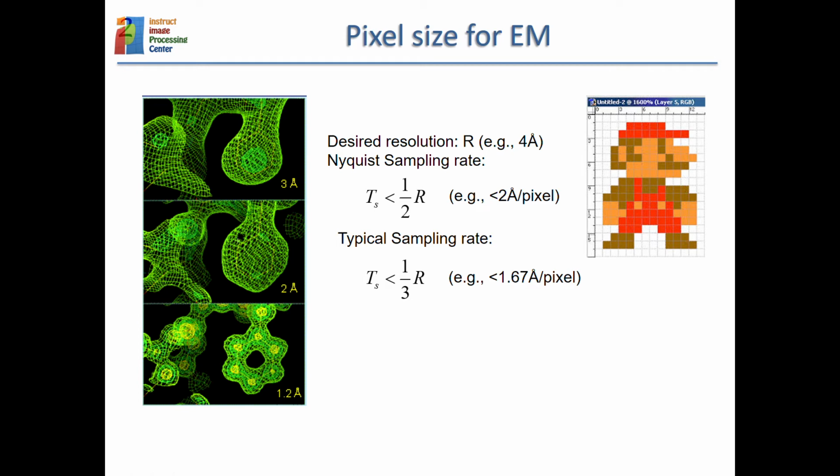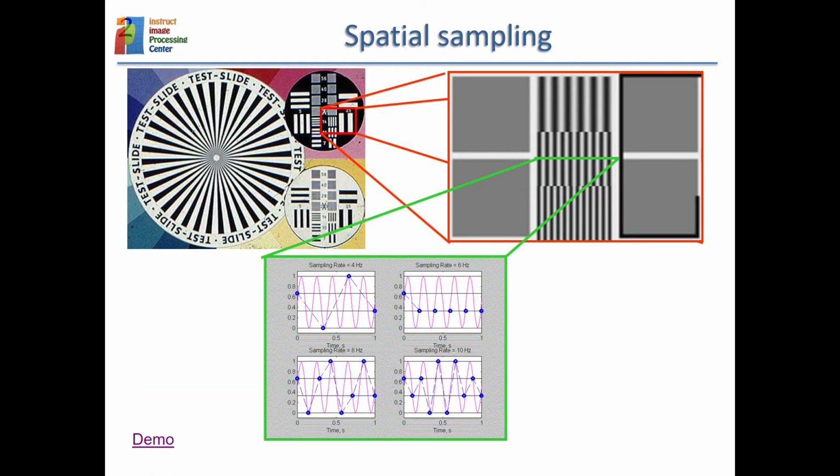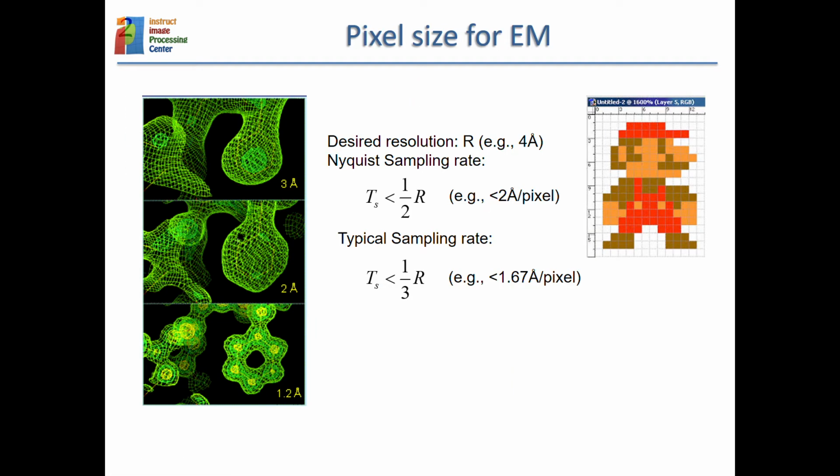Why is this important? Because the wave in cryo-EM is the size of the object that you want to see, the finest size of the object. So we would all like to see things at a resolution of 1.2 angstroms, so that for instance, for an aromatic ring like this one, we see the hole in the aromatic ring, we see the individual atoms.